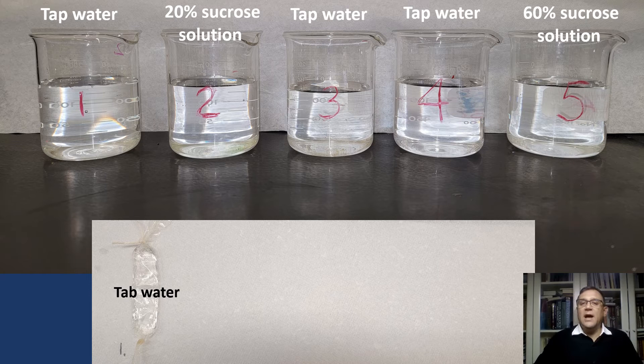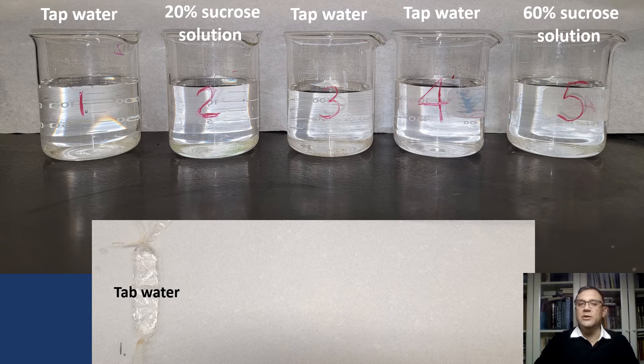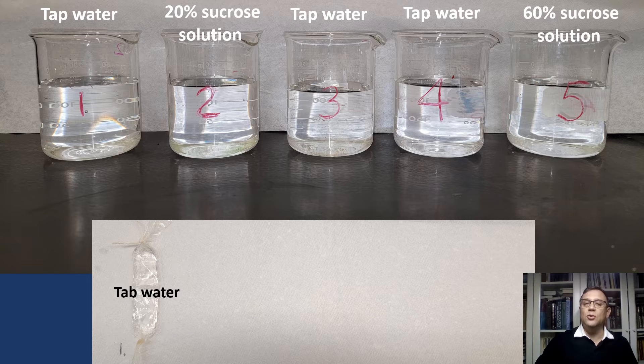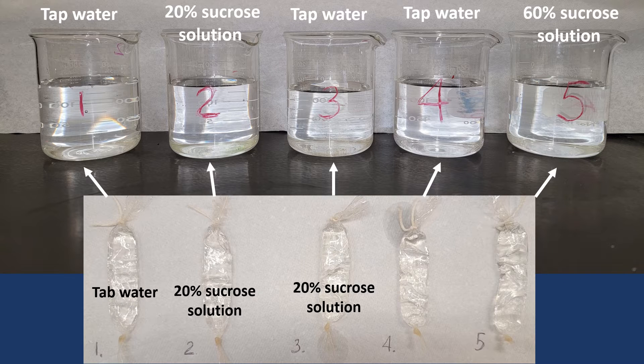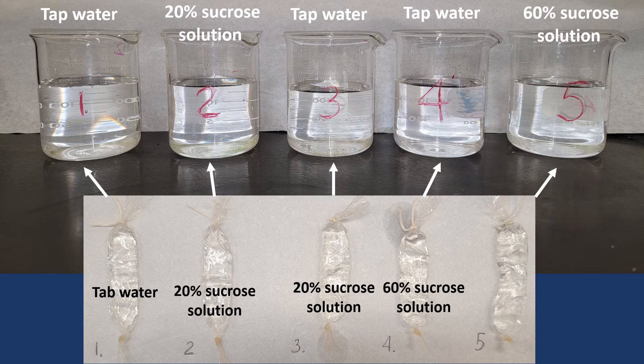So we have made our first dialysis bag filled with water. In the next two bags, we will add a 10 ml sample of 20% sucrose solution. We will place the bags on a paper towel next to our beakers. In the fourth bag, we will add 60% sucrose solution. And in the last one, we will add tap water.